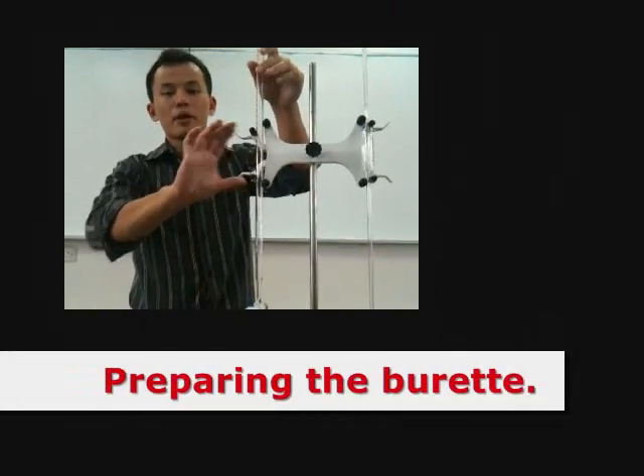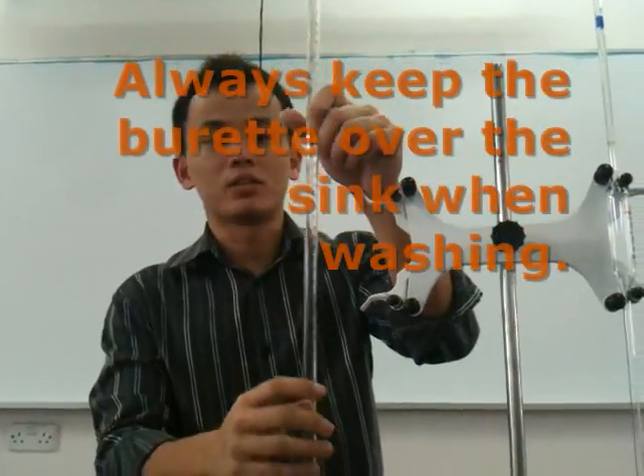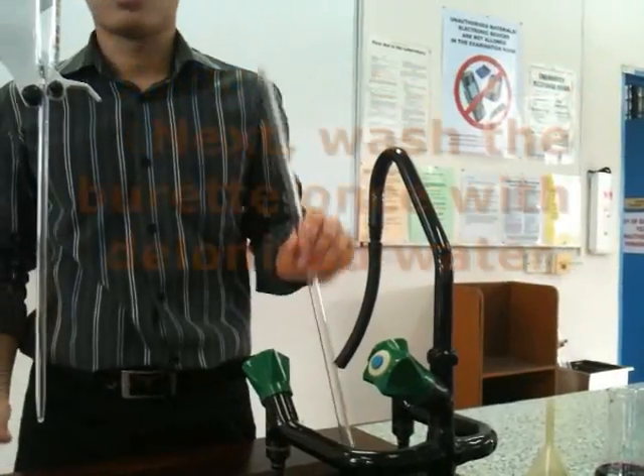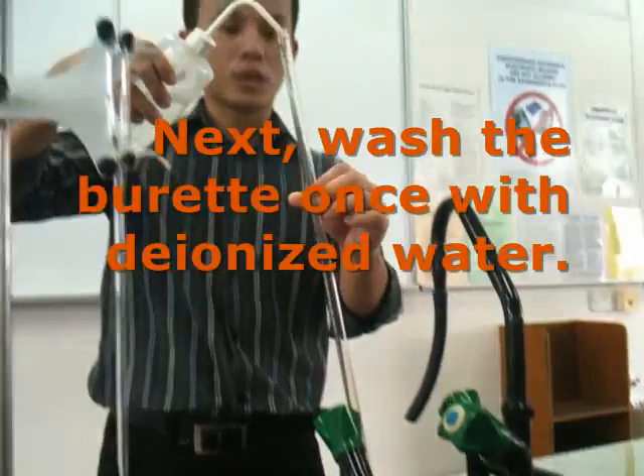The next step is preparing your burette with your potassium permanganate — KMnO₄ — solution. Wash it with your water. You should really wash it once with your tap water, then wash it again with your deionized water.